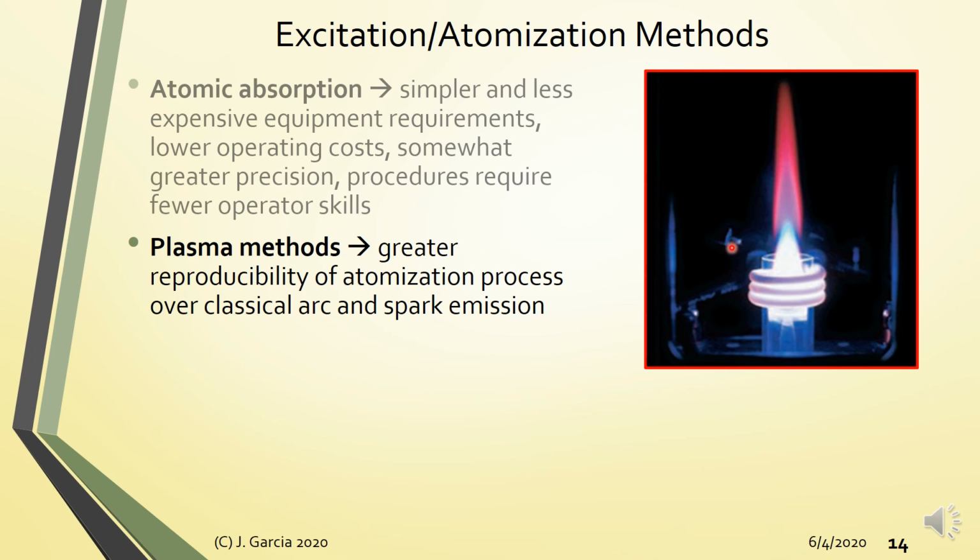Compared to the arc or spark emission methods, it has a greater reproducibility. Also, spectrometers based on the plasma method are designed according to the multiplex design.